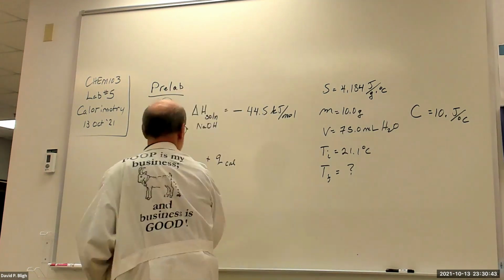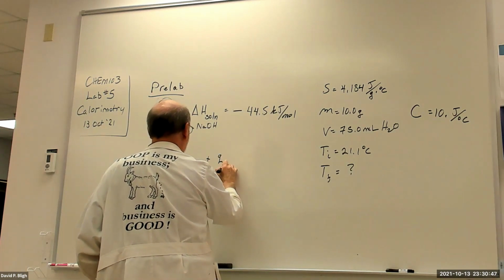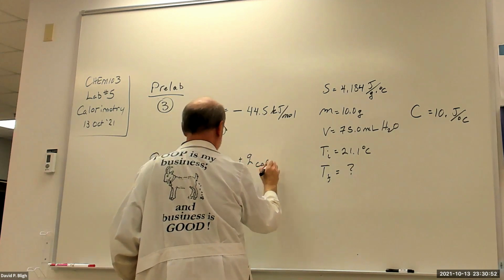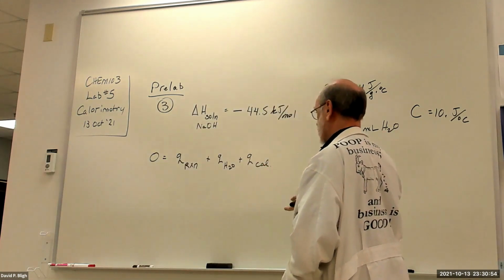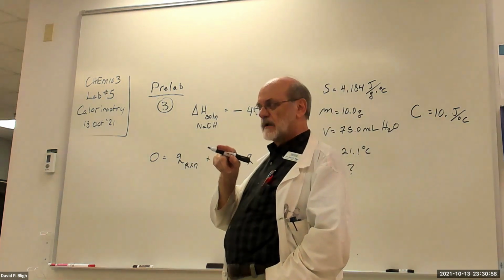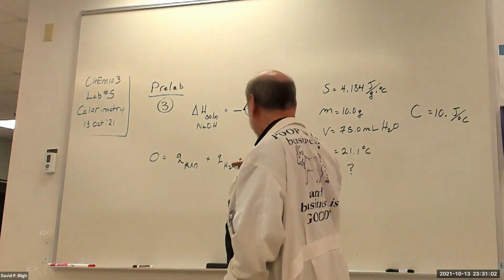Well, actually, no. The heat change of the water and the heat change of the calorimeter. So those 3 factors are common to each of your experiments today, all 3 of them. Okay.